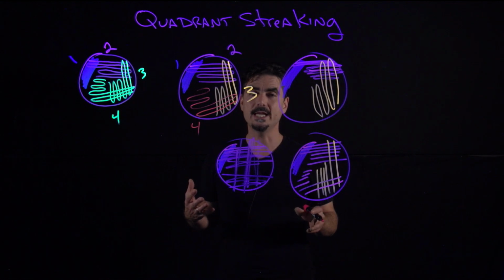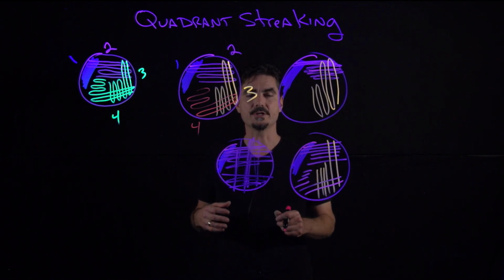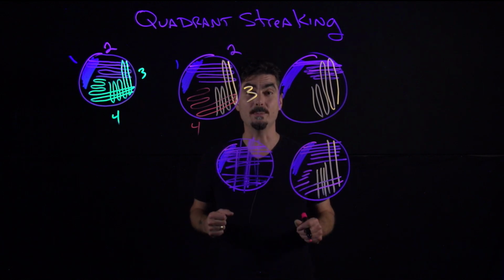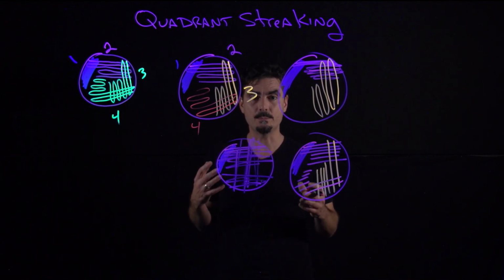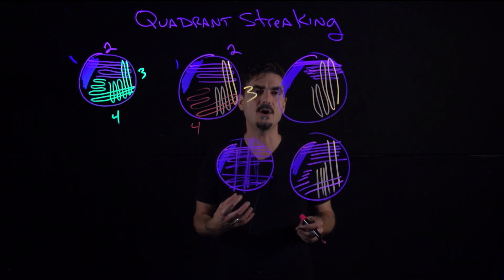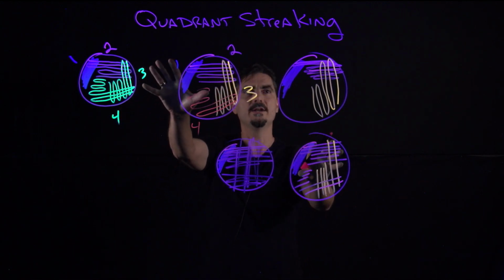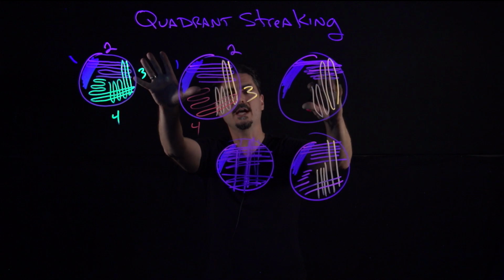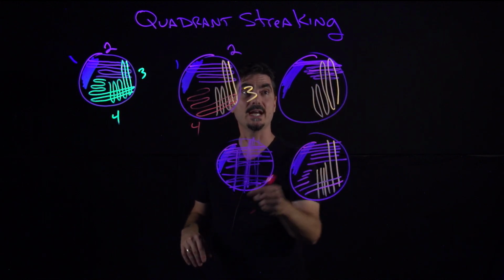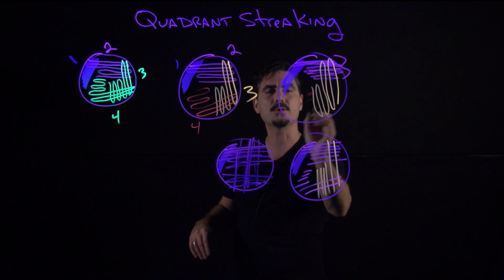And the proof ultimately is, what is the growth pattern on the plates after your bacteria incubate? And that is where part of the points are built, and that is, I can look at a good quality image of a plate, and I can tell pretty much whether you did a good version, right? And this is still good, right? Or you did a bad version, right? Well, this part up here isn't good, actually, right? Going back and forth. I meant this part is okay.